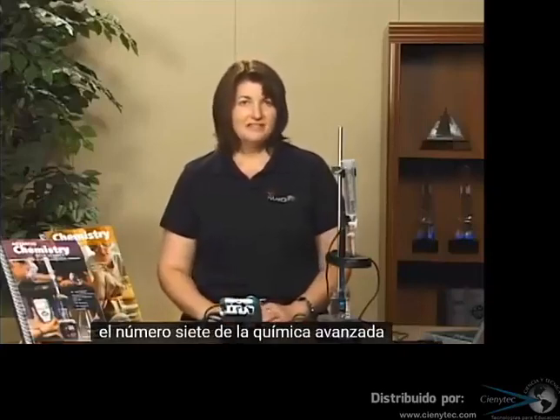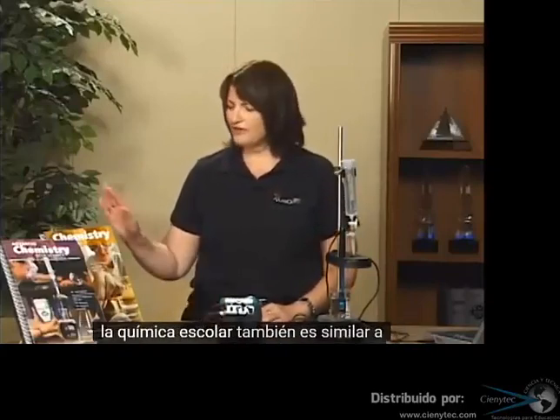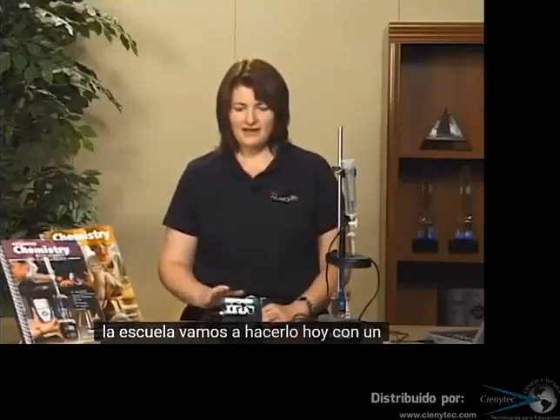An acid-base titration. It's lab number 7 from the Advanced Chemistry with Vernier lab book. That experiment's appropriate for college or AP high school chemistry. It's also similar to experiment number 24 in the Chemistry with Vernier lab book for regular high school. We're going to do it today with a computer and a LabQuest, and I'm going to show you some of the equipment that you're going to use to do this lab.